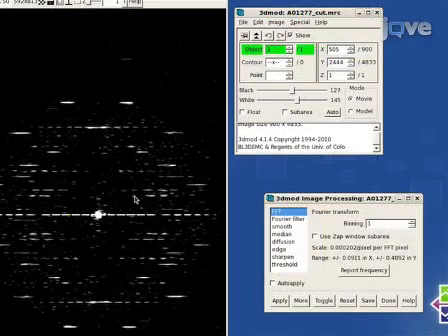Next, choose two principal layer lines that define two basic surface lattice vectors, 1, 0 and 0, 1. In units of FFT pixel, determine the layer line numbers as well as the radii of maximum amplitude for the two principal layer lines in the Fourier transform.